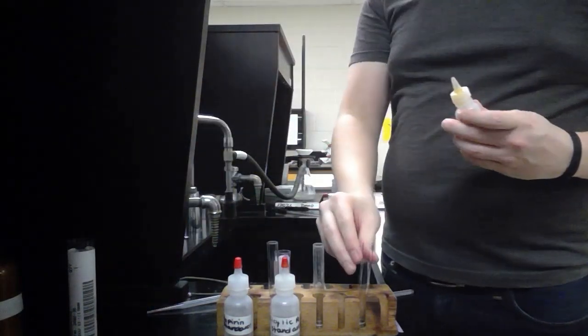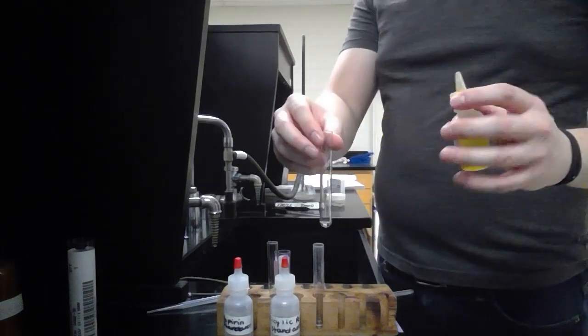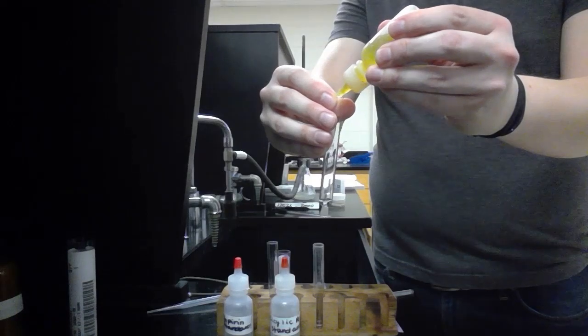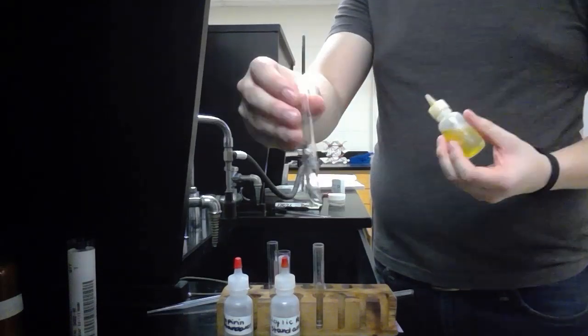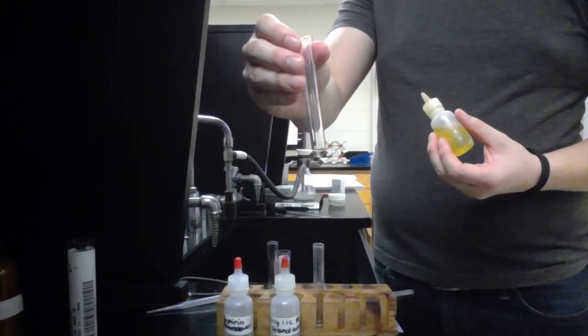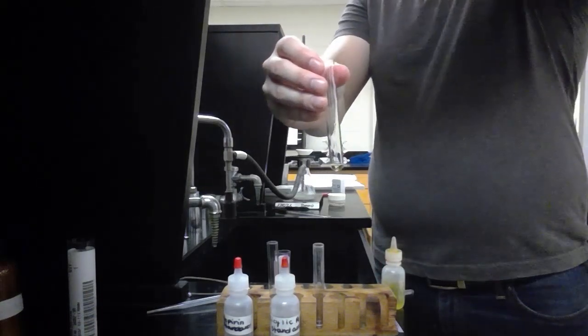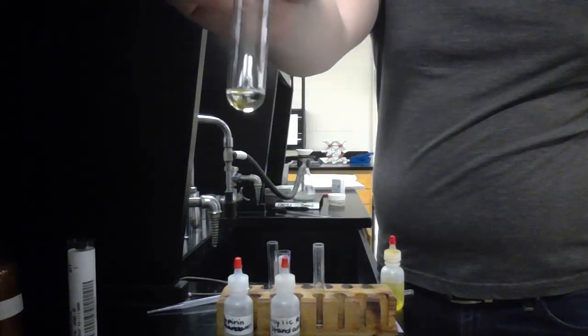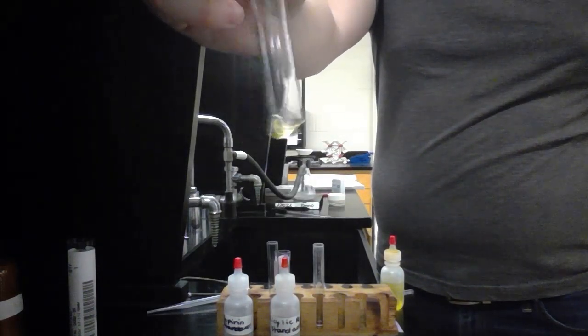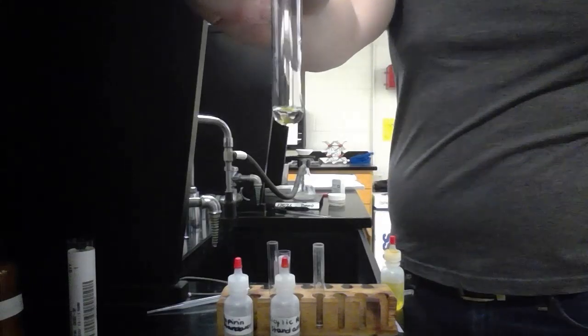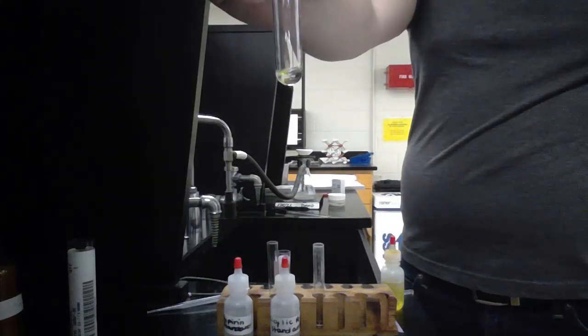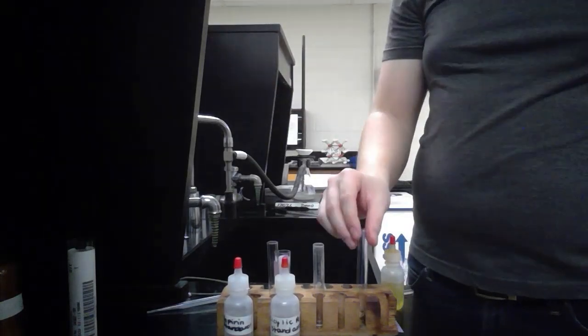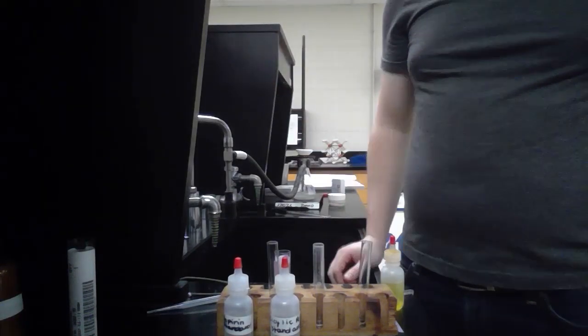The next test that we'll do is the ferric chloride test. We're just going to add one drop of that in with our made aspirin and look for a color change. A positive test would show a blue or purple. Here we can see that there is no color change, so we have a negative result. This only reacts if there is a phenol present and if there is leftover salicylic acid, since that is a phenol. So that one is a negative result.